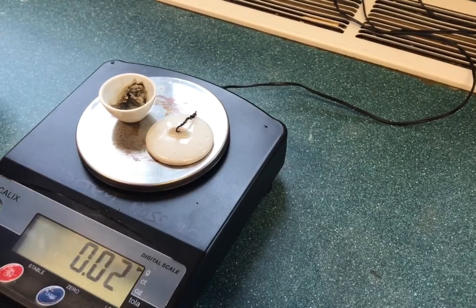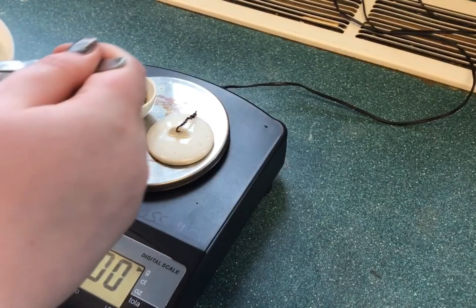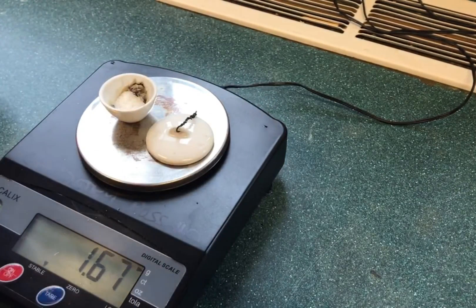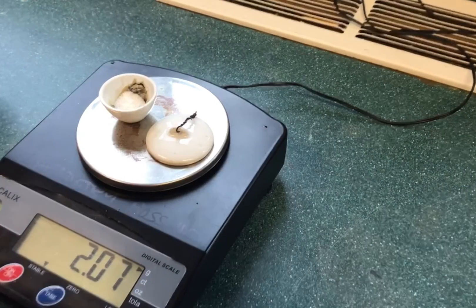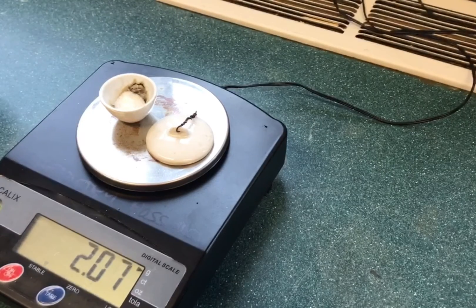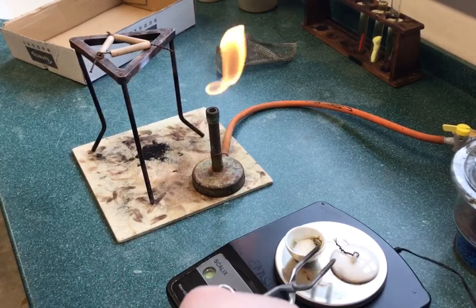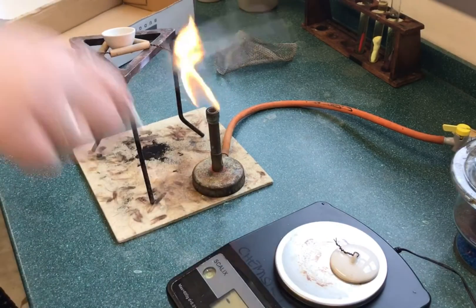We're then going to weigh out around 2 grams of hydrated barium chloride. The crucible is then placed on a Bunsen and heated strongly for around 5 to 10 minutes to try and drive off any water within the hydrated barium chloride.